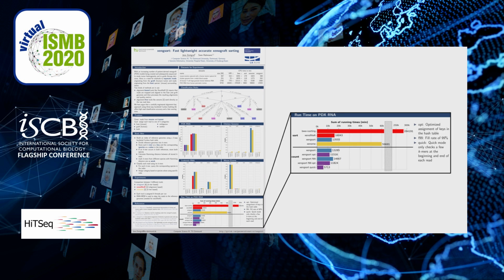At the end, let's have a short look at the runtime. As you can see, the alignment step using BWA takes over 284,000 CPU minutes, and xenofilter needs additionally 16,000 CPU minutes to analyze the alignment. Xenome is a lot faster. It only needs 60,000 CPU minutes, and xengsort is even faster than xenofilter without the alignment step and only needs 13,555 minutes.